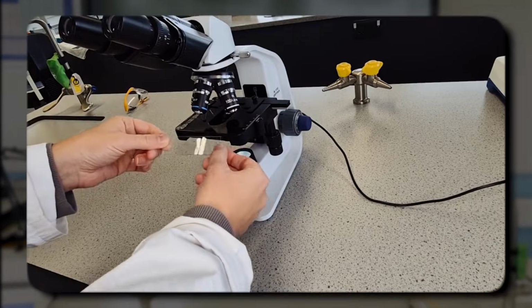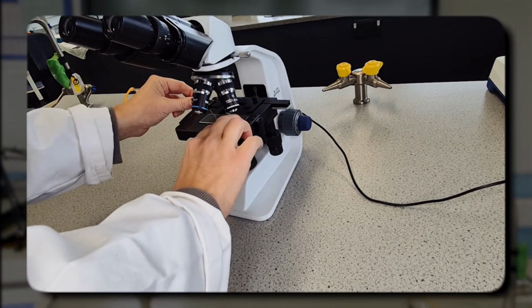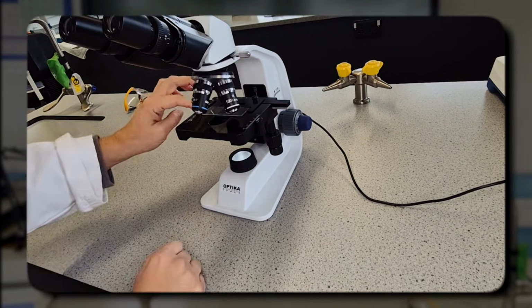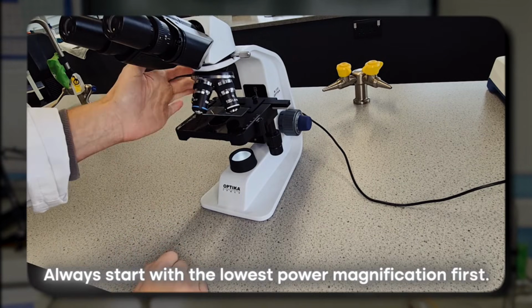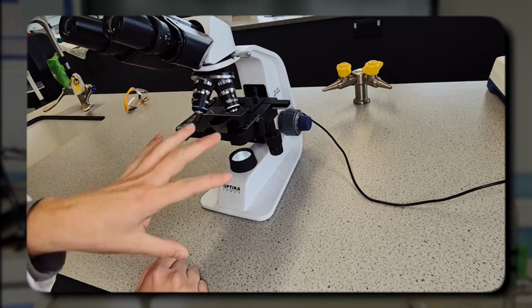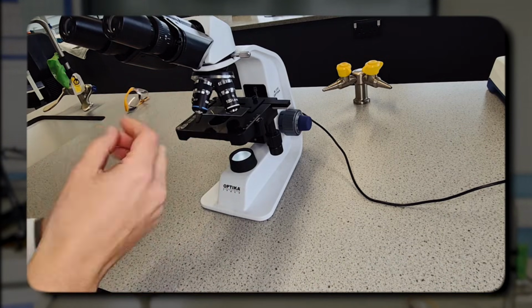So I'm going to take my microscope slide and get the students to place it on the stage, and it's then clipped into position. Always start with the lowest power magnification first, because it's easiest then to find all of the cells, and then they can work their way up.